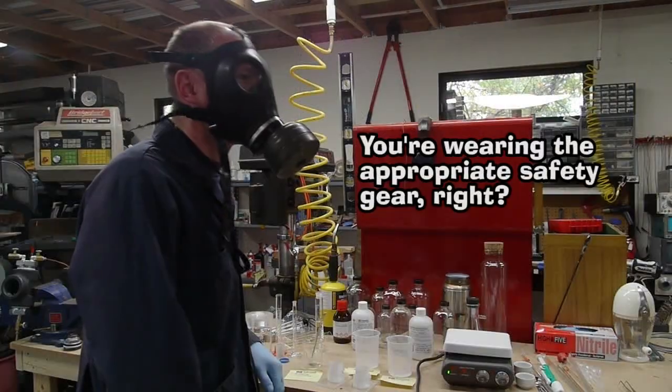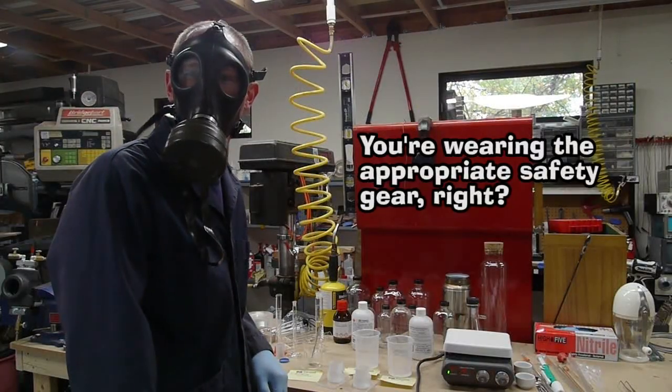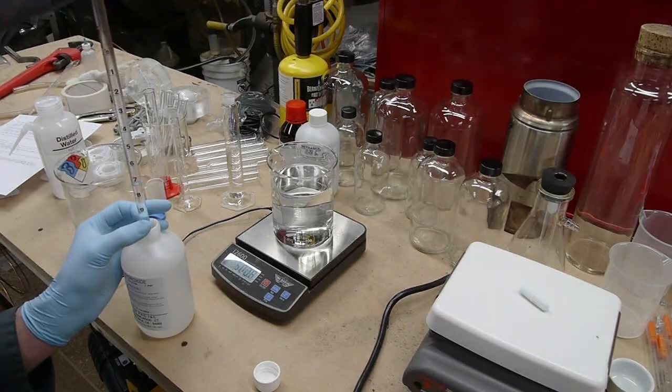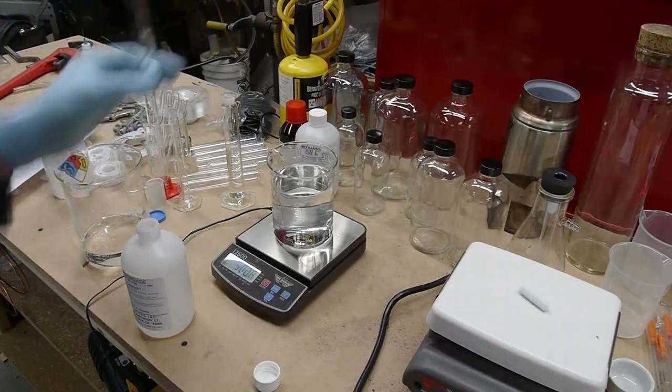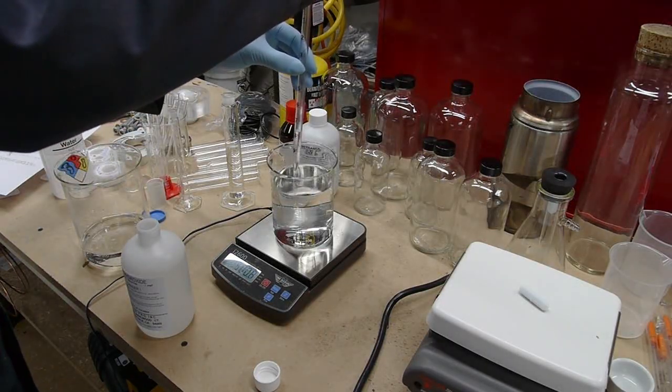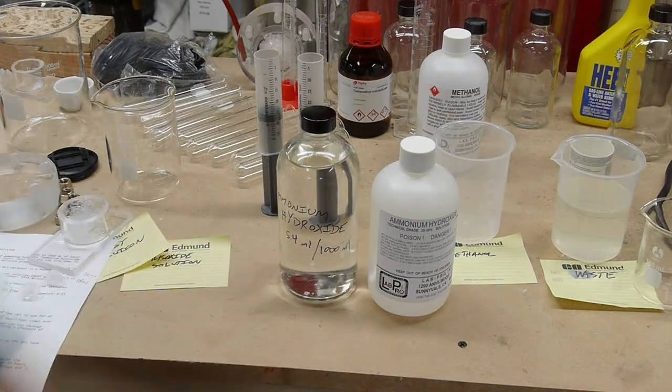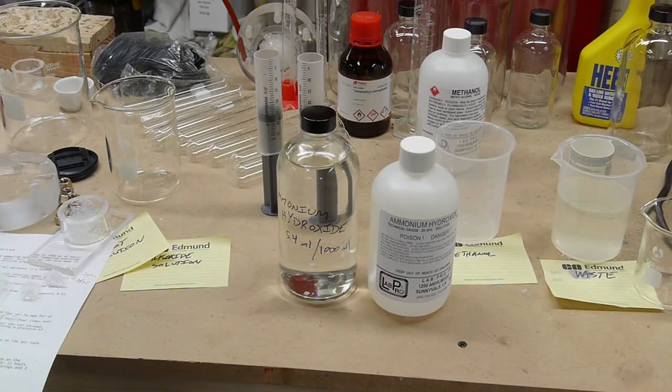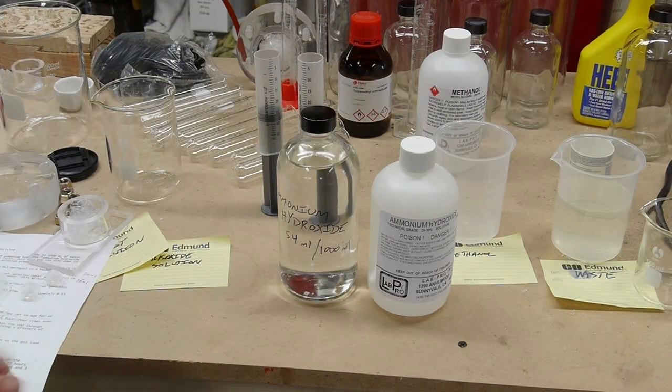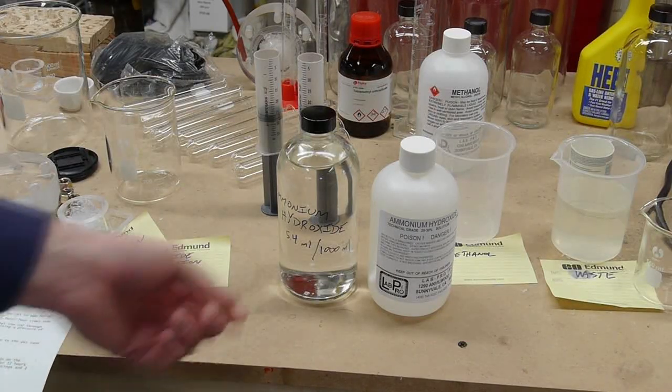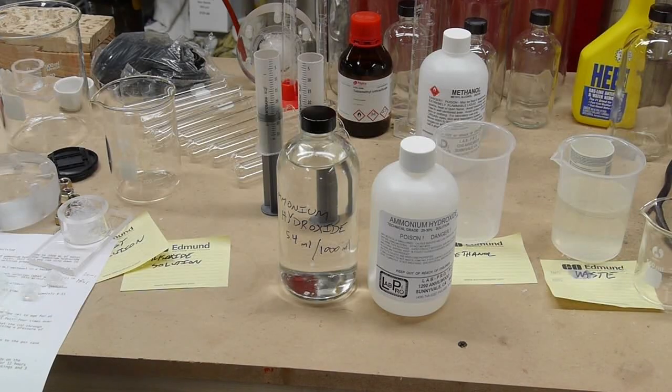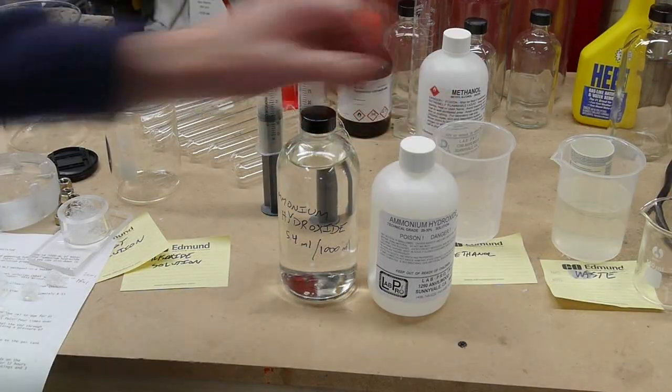So I followed the directions off of aerogel.org pretty closely. The first step is just to measure out a little ammonium hydroxide. Concentrated ammonium hydroxide is about 29 to 30 percent. And I got this, as you can see, at LabPro. LabPro actually will sell chemicals to individuals. These guys are based in Sunnyvale or Santa Clara, right around here. But they wouldn't order tetramethyl orthosilicate for me because they didn't even have a source for it. I got this chemical from Sigma Aldrich and Sigma Aldrich won't even ship chemicals to LabPro because they're worried that LabPro will resell them to individuals. It's really quite ridiculous. But anyway, you can get some stuff from LabPro that isn't too exotic.